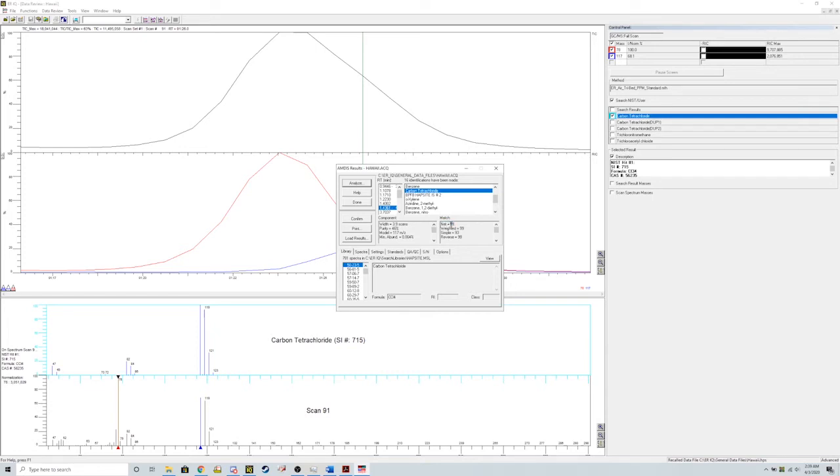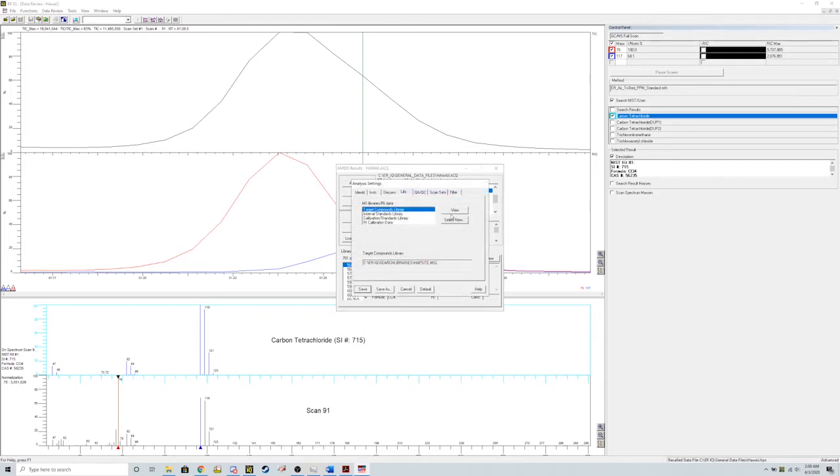But there's an additional problem with AMDIS. AMDIS is only able to identify the chemicals that are in its specific library. In this data file, I'm searching for things in the HAPSITE.msl library. Let's try and change that. I can go here to Analyze, and then over to Target Library, and I can view all the possible identifications AMDIS can make with this HAPSITE library loaded. But let's say our secondary identification, down here we had a possible trichloronitromethane where we were looking back in NIST.